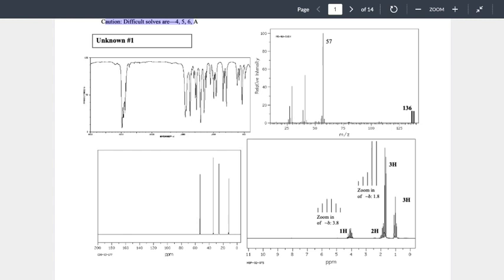Which one is the IR? Top left is the IR. How do you know that? That's what IR looks like. Well, what are you looking at to say that that's what IR looks like? So we can think about that. Our peaks are all aimed downwards, whereas in the other case, all of our peaks are upwards. So that could be a good tip-off.